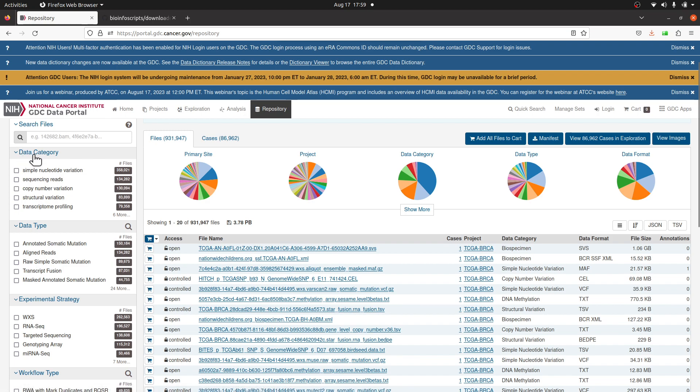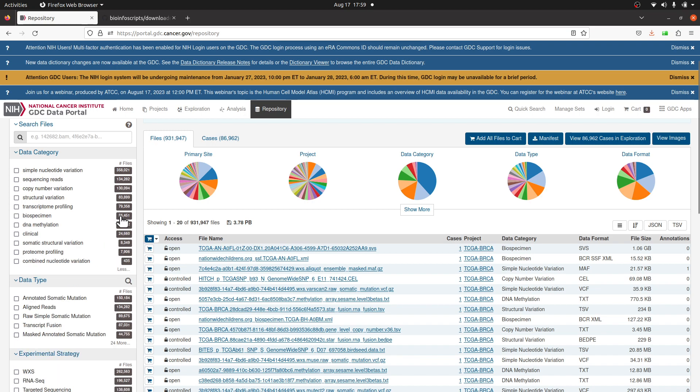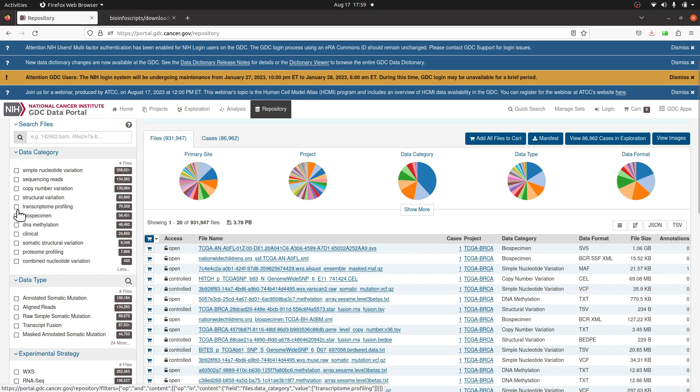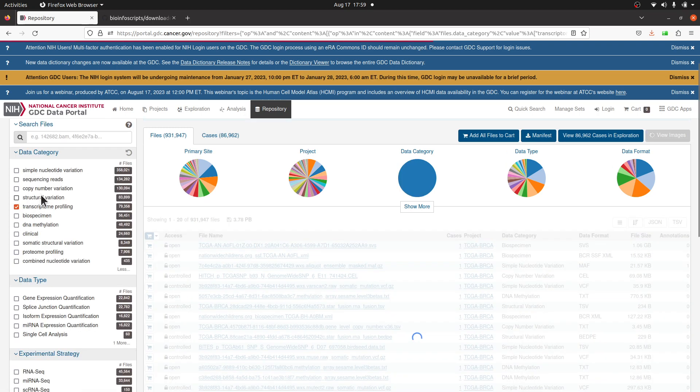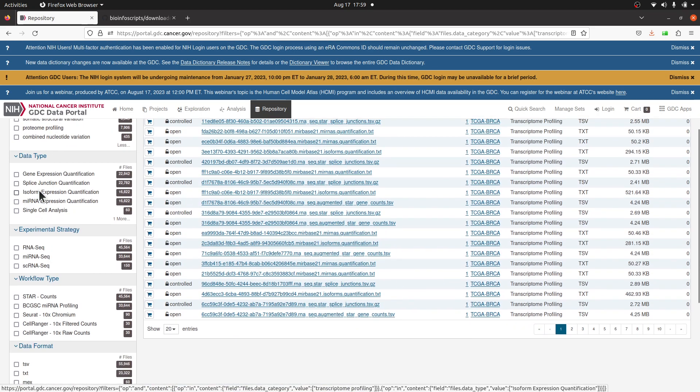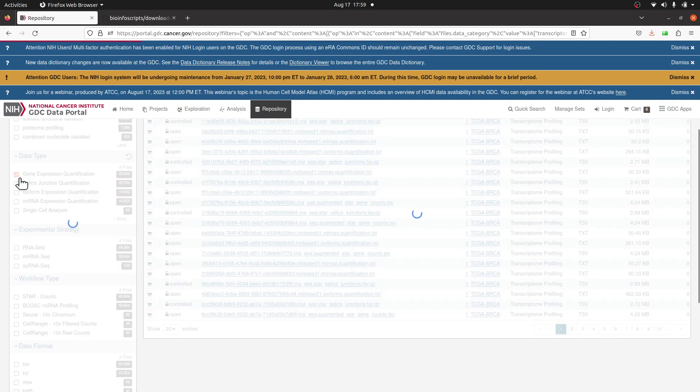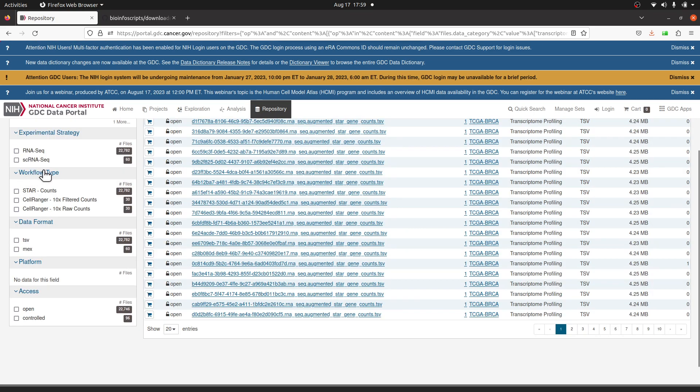I will select Transcriptome Profiling, which is this one. If you don't see it, come to this side - you see it says six more - you can click it and you have the rest of the categories shown. Select Transcriptome Profiling. I will check mine and then scroll down to Data Type. Here I will select Gene Expression Quantification.